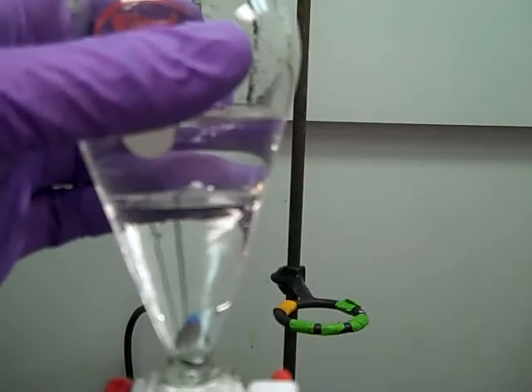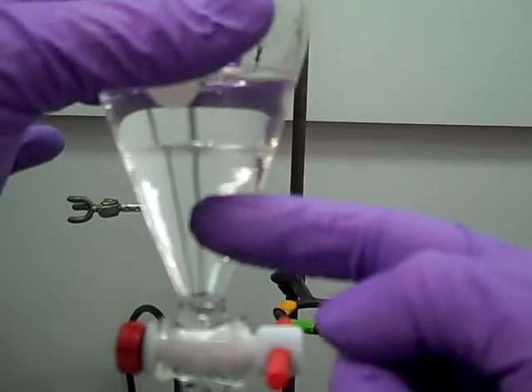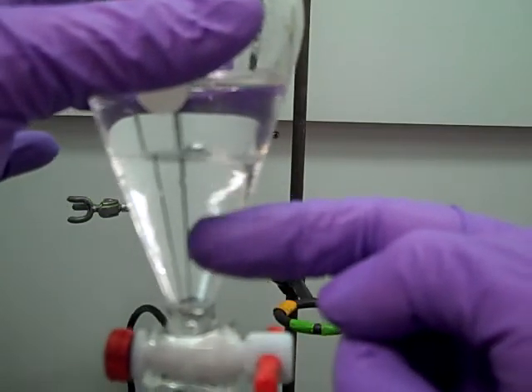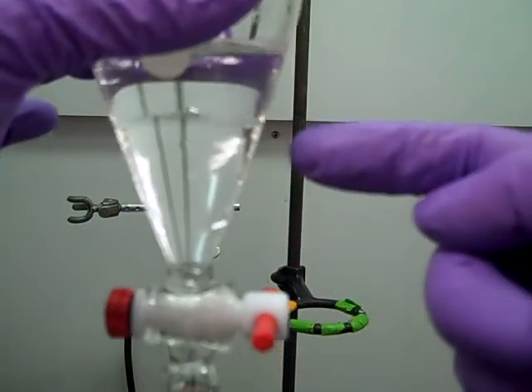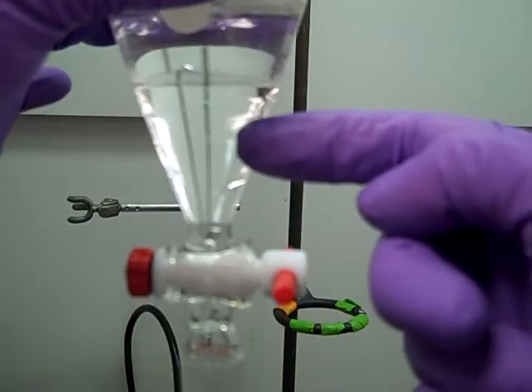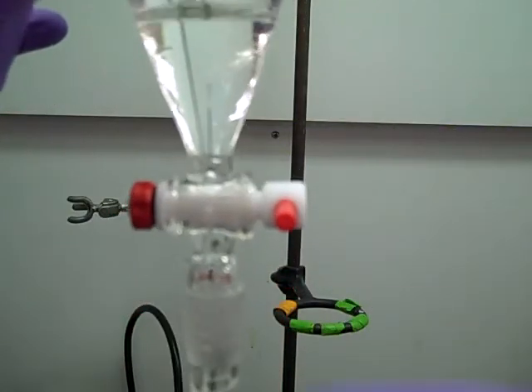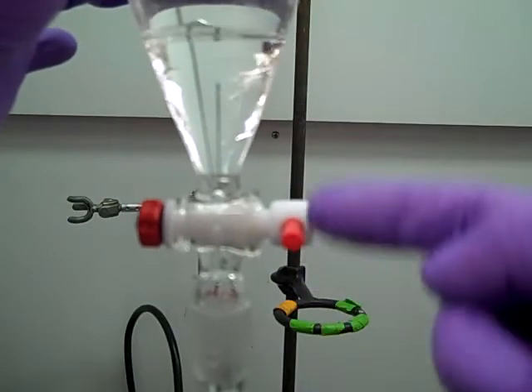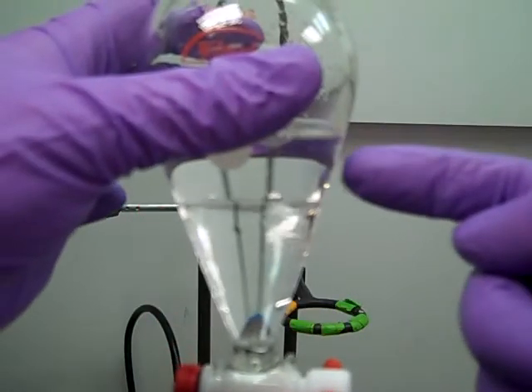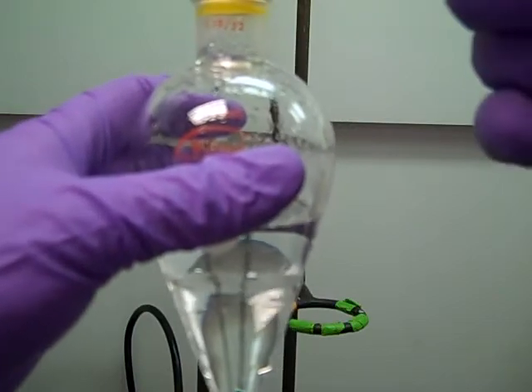So once we've separated our two layers, now we need to get the bottom layer, which in this case is the organic layer, out. So the bottom layer always goes out the stopcock at the bottom. So bottom layer, out the bottom, and then the top layer, which is water in this case, is going to get poured out of the top.